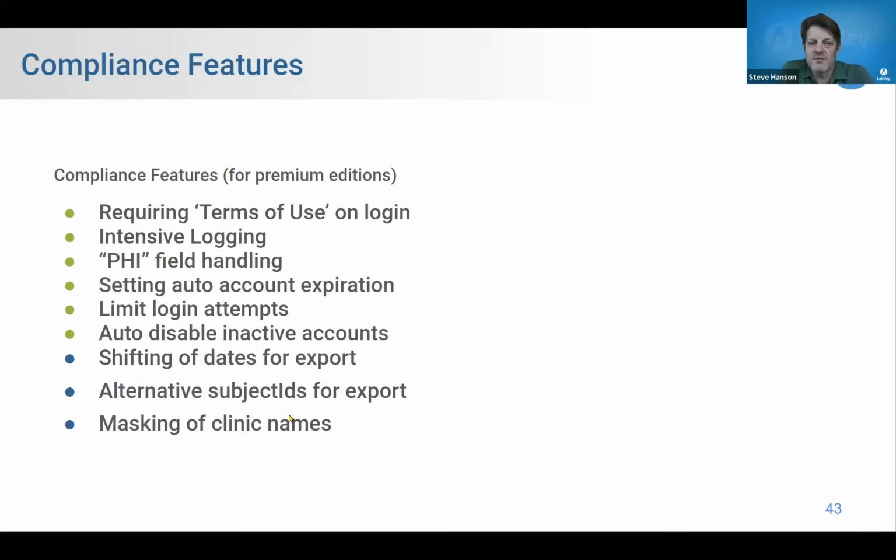There's a premium edition feature, but you can do things like require users to sign a terms of use. You can also have special handling for protected health information. So if you have, say, a field that's like, God forbid, a social security number or disease diagnosis, something sensitive, something you don't want to just give out, you can hide that field from users using the compliance features.